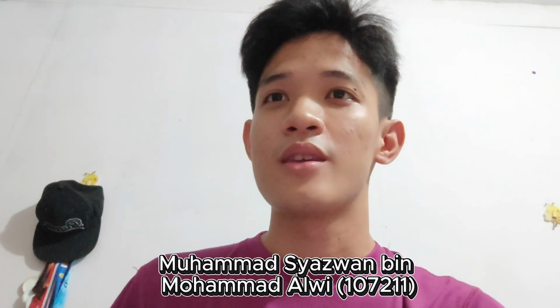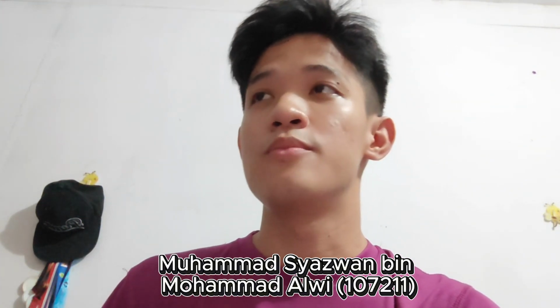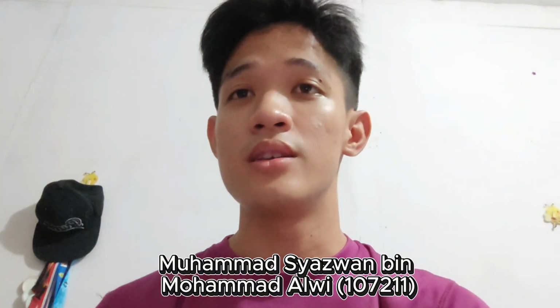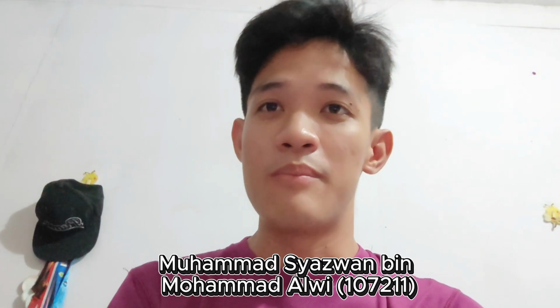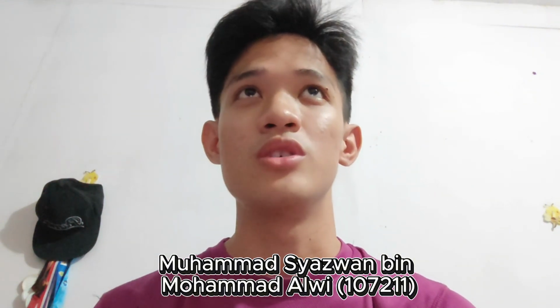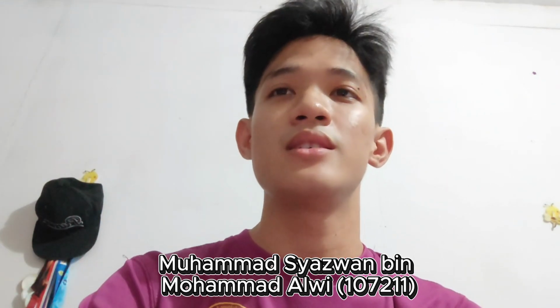Thank you. Assalamualaikum. I am Muhammad Shazwan bin Muhammad Alwi. In this lab, we have learned how to use the spectrophotometer to measure protein concentration using the Bradford assay, and then we have learned essential lab skills such as how to use the pipette, data analysis, and interpreting the result using the theoretical concept, which is the straight-line equation, y equals mx plus c.